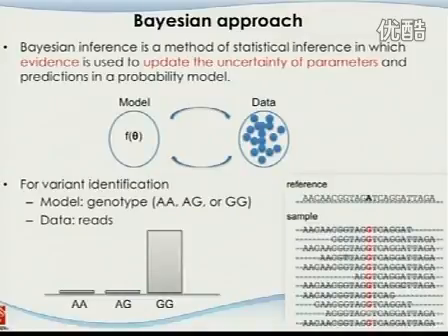And for this one, you can probably safely tell me: is it possible for this region to be AA? Here we have 11 reads, 10 of them are G, and 1 is C. Is it possible that this is AA? It's possible, it's just unlikely. This is a choice of words. Anything is possible. It is possible that this is AA and every single read here is an error. It's just that the probability is very, very low. You can still evaluate that.